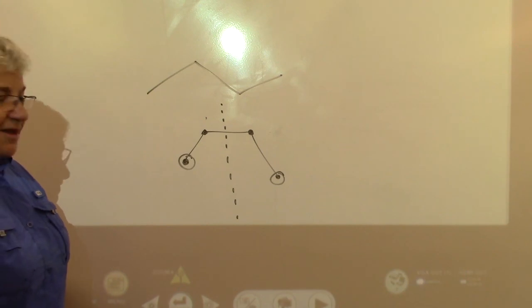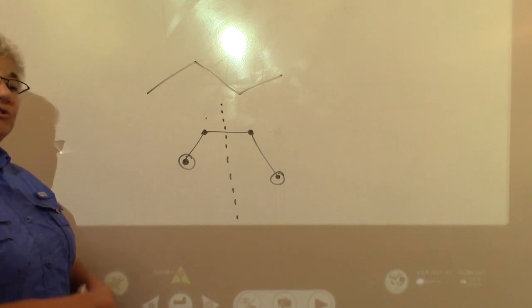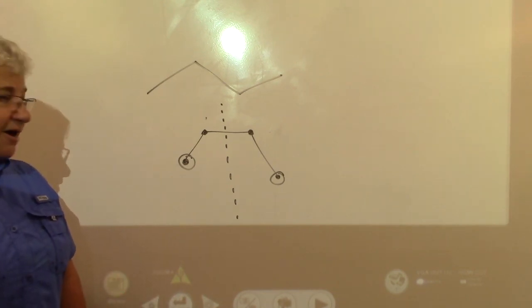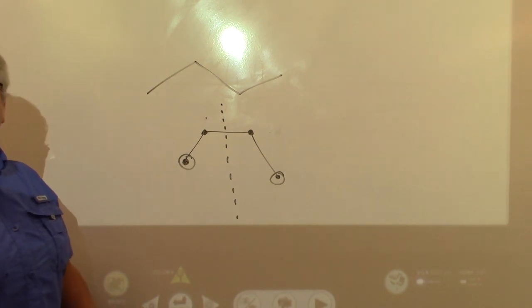So for butane, I would also expect to see 2 peaks, or 2 carbon resonances in my spectrum. And if you look at your sheet, you do, right? You see the TMS peak, and then you see 2 other peaks.